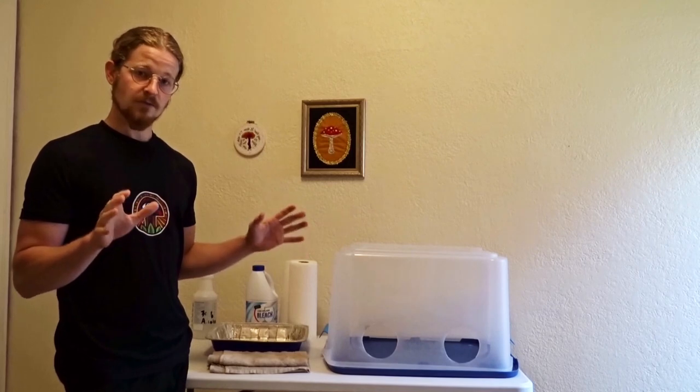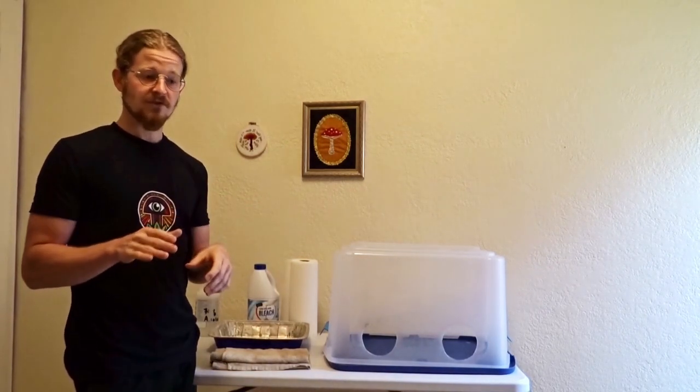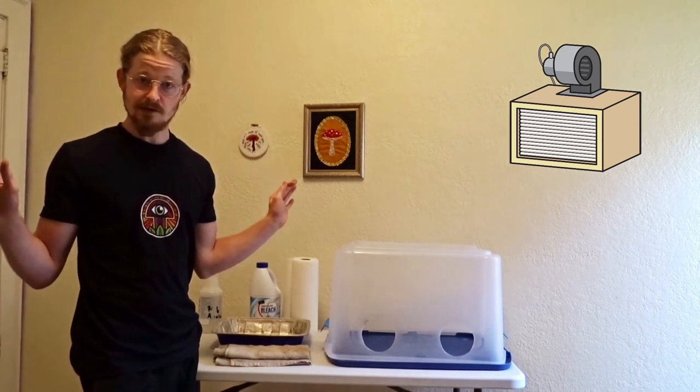Try to do your Still Air Box work in an environment where there's no moving air outside of inside here — so no AC running, no heat, no fan. It's also a good idea, like I used to do when I first started, to take a shower before you do any work. I used to do it every single time; now I work with the flow and I don't have to.